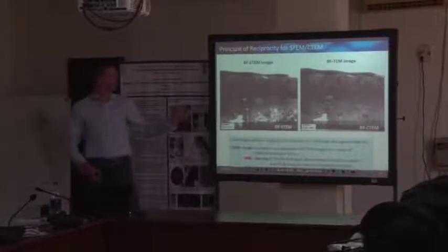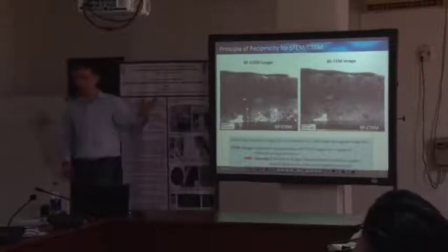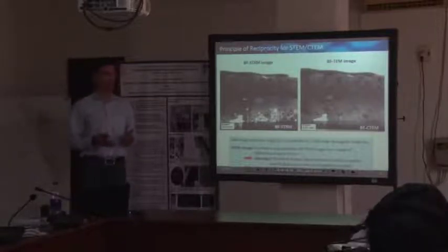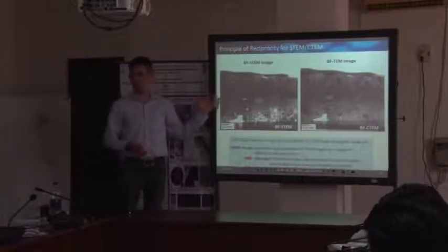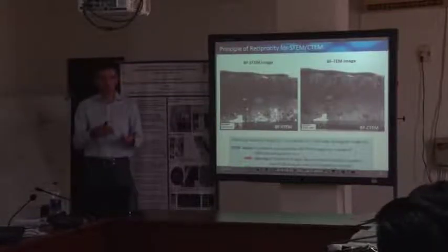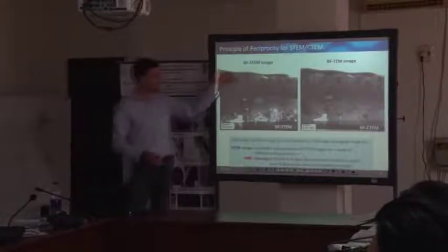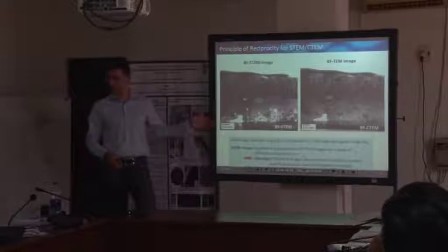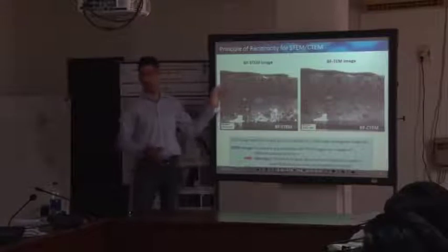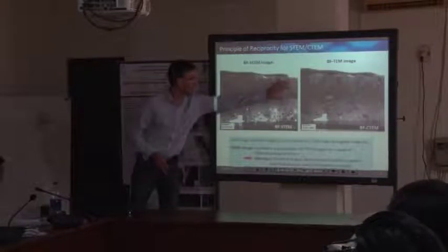You can do many of these analyses that you know from conventional TEM mode, and you can also see those contrast features in the STEM images. You will see the lattice defects, you will see polycrystalline material, and you will get some insight into the grain orientation. If you just do pure chemical contrast imaging of this structure here, you will hardly see all those individual grains, because the chemistry here is the same.